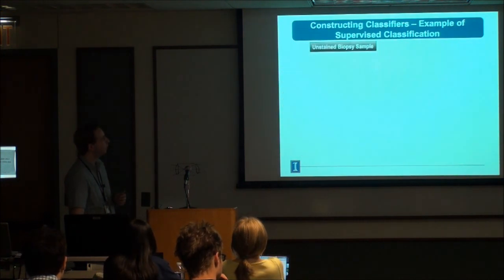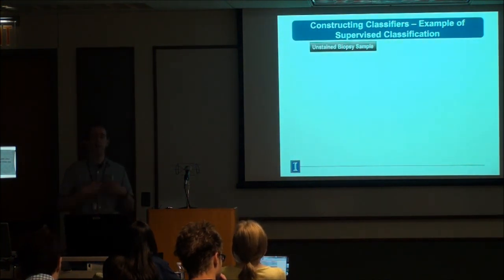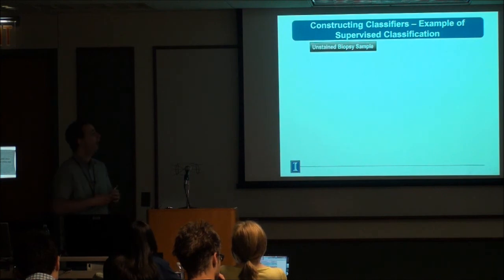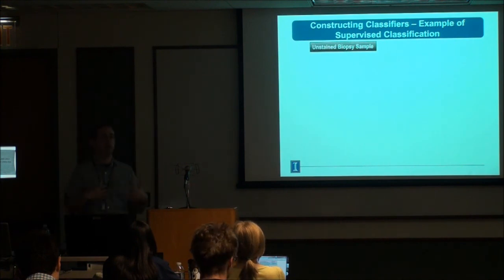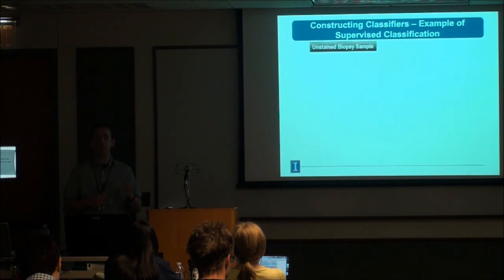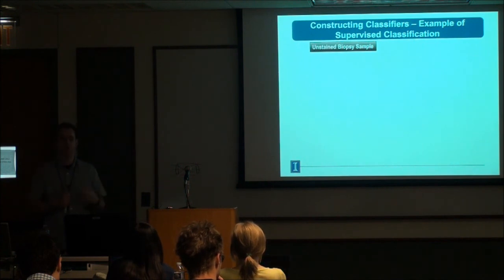Okay, so one of the big things that our group's been working on has been building these classifiers to segment out tissue. So in my opinion, the most important part of doing spectroscopy of tissues, and there's been a big failing actually in the field, is that if you're just taking bulk measurements of different tissue types, you're going to get cell-specific differences. So a lot of the early work looking at cancer versus no cancer, actually all they're detecting is cell type differences. It's not really cancer differences.